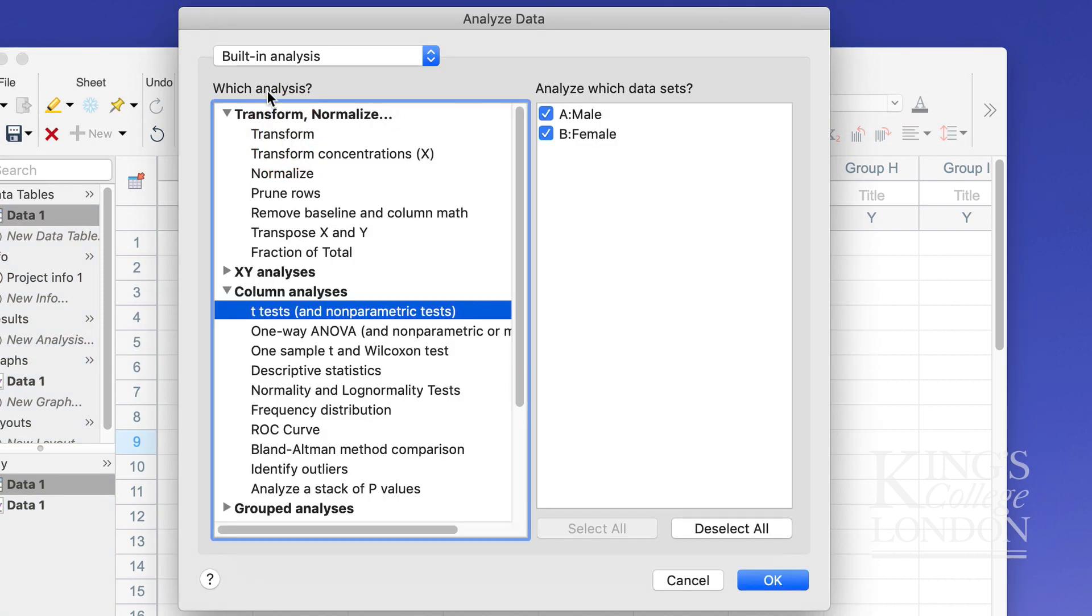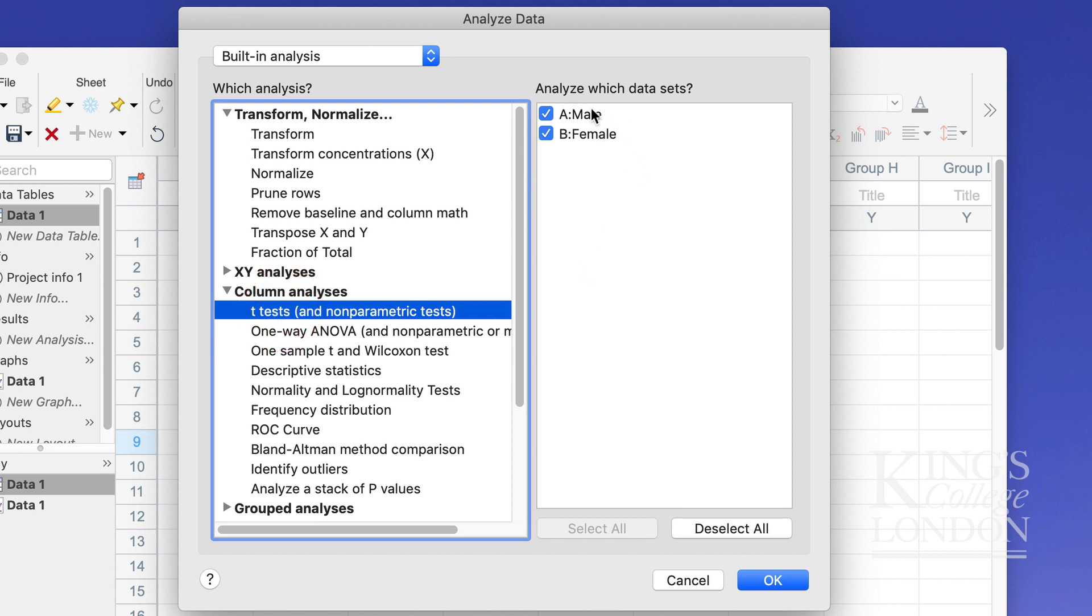You choose the built-in analysis and if you go down you'll find the section labeled column analyses and this is where you'll find t-tests and other tests. We're going to click on t-test and we're going to select our two data sets male and female and click on OK.